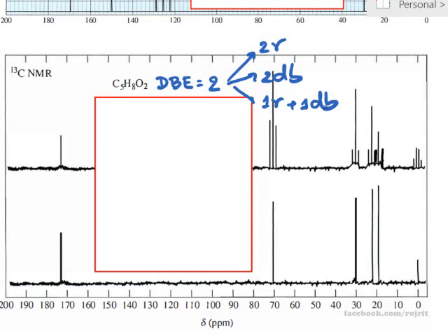But anyway, we can see this signal, which is very important because it is 100 something, very far. This is the characteristic peak of a carbonyl group. So you have used 1 double bond already, so 2 rings is impossible, right? The alternatives are carbonyl with alkene to be 2 double bonds, or carbonyl with a ring, right?